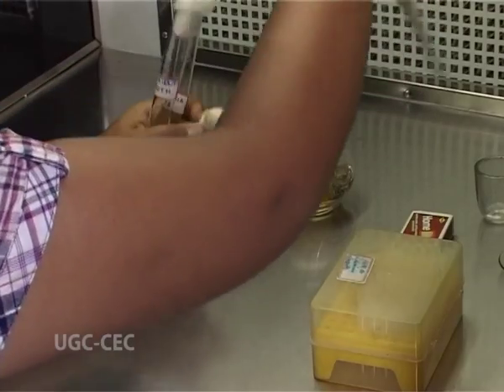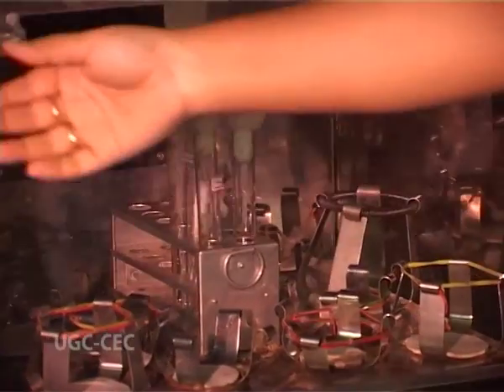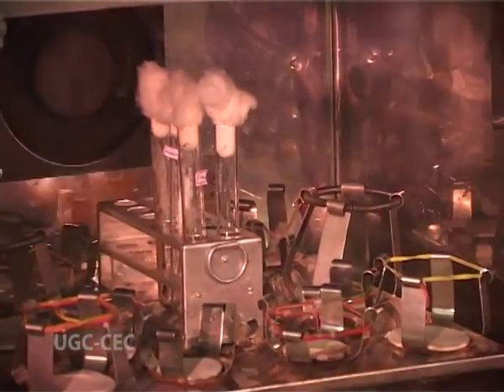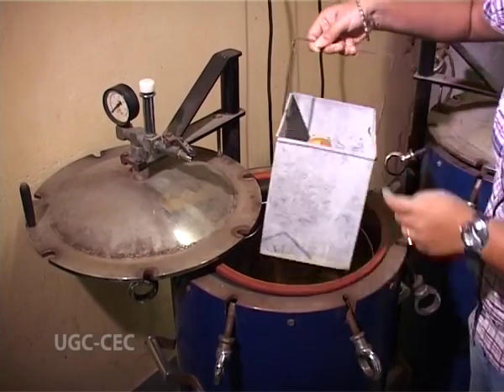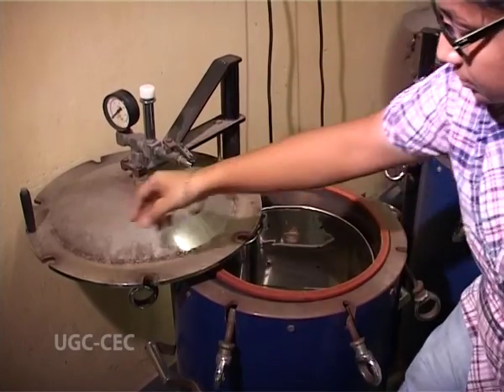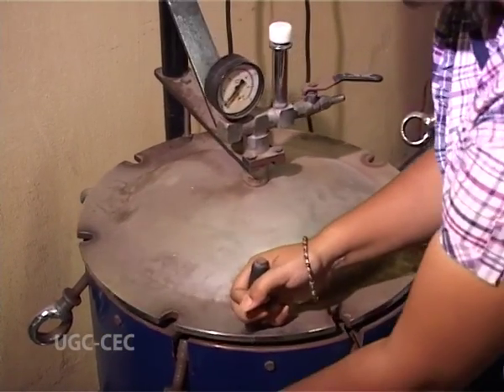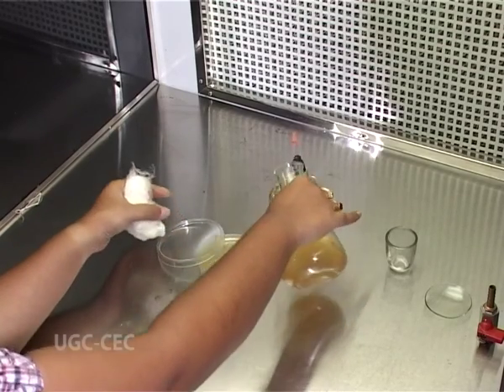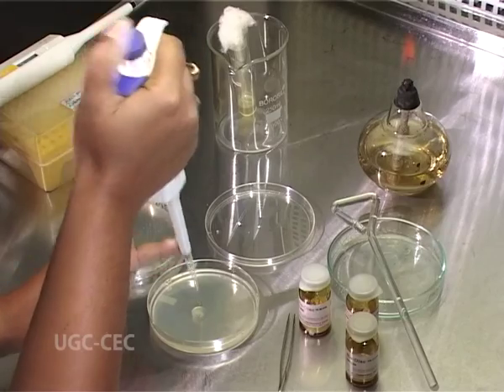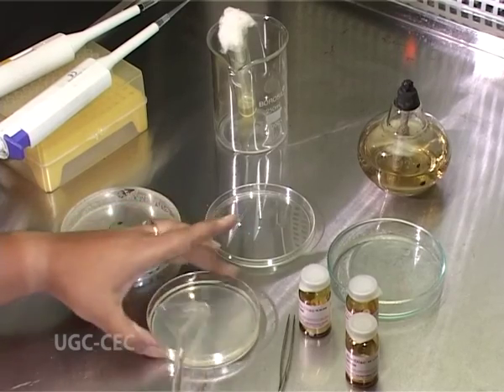First, the target organism, maybe gram positive or gram negative, will be inoculated within the nutrient broth and will be kept at 37 degrees centigrade for 24 hours. The nutrient stabs will be prepared, solid stabs, and will be autoclaved at 15 pounds per square inch pressure. Next, that particular stab will be liquefied and poured inside the petri dishes and allowed to solidify. Next, after solidification, with a spreader, 1 ml of microorganism will be spread over the solid agar plate.